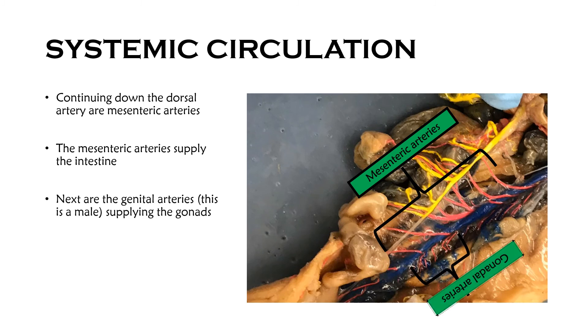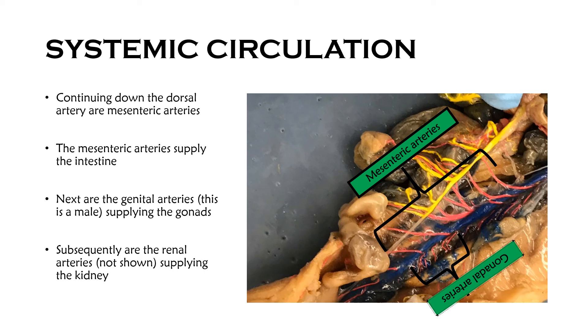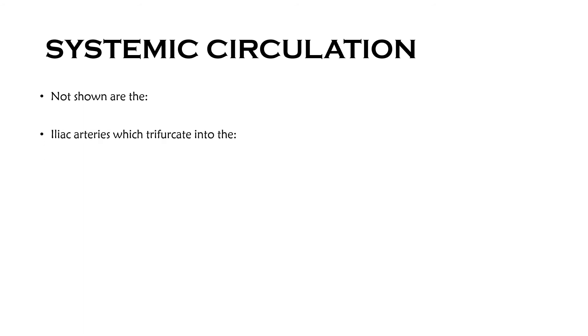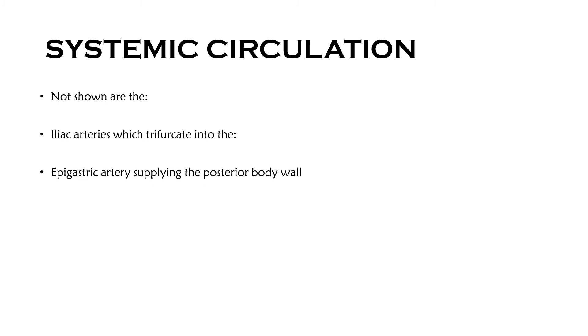The next arteries are the genital arteries. This particular mud puppy is a male, and they are supplying the testes — that gonad sitting sort of to the side, sort of blue and brown, is the testis of the male mud puppy. There are also renal arteries, not shown, supplying the kidney, because renal means of or related to the kidney. Some arteries not shown in this video but important to know are the iliac arteries, which trifurcate into the epigastric artery supplying the posterior body wall, the hypogastric supplying the urinary bladder and cloaca, and the femoral artery supplying the hind limb.